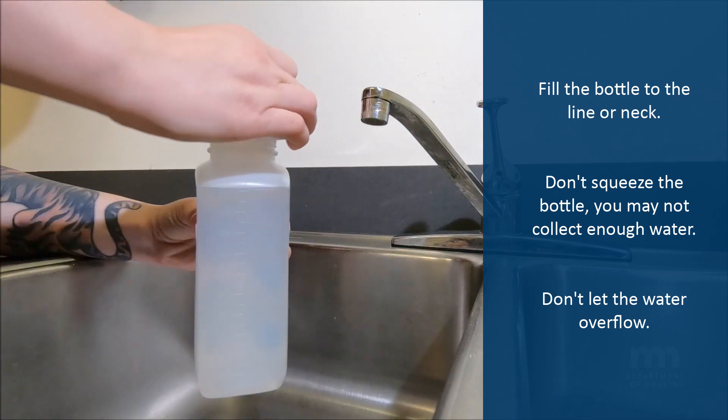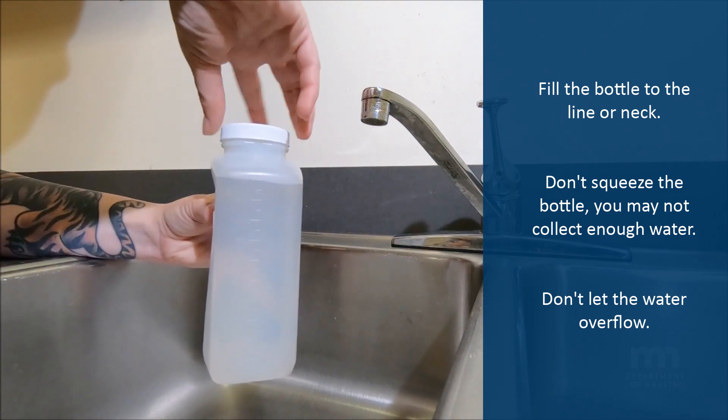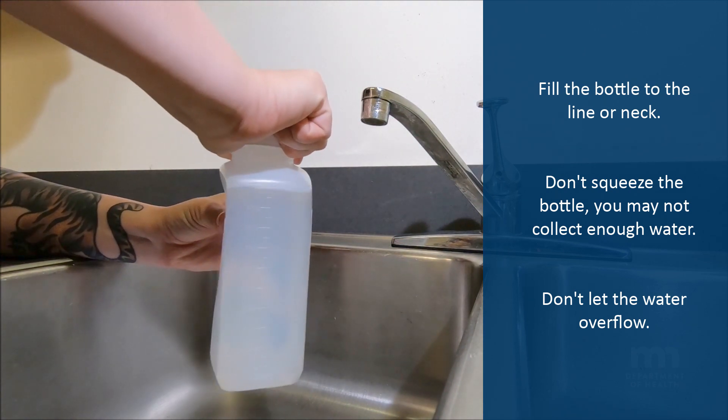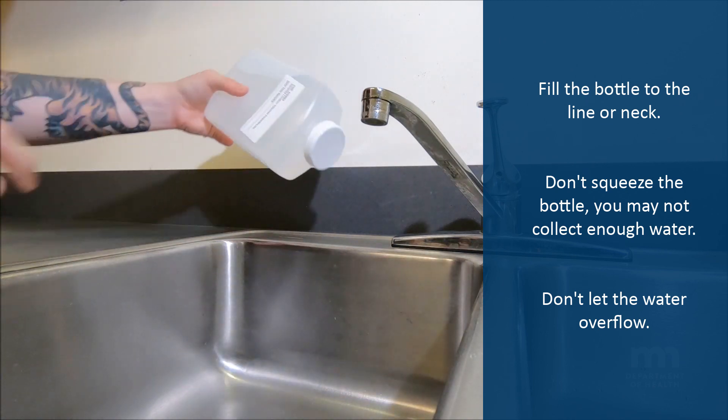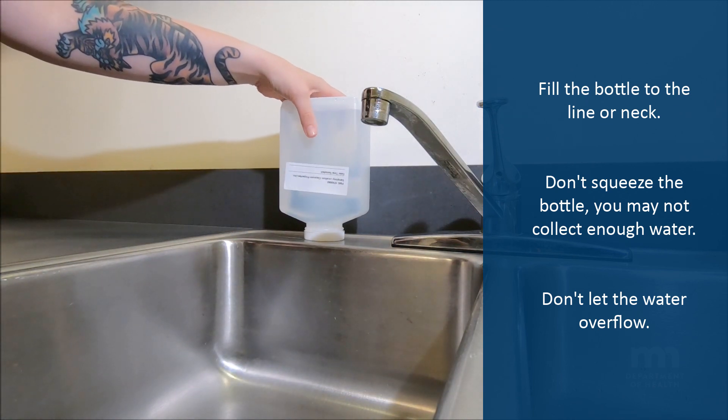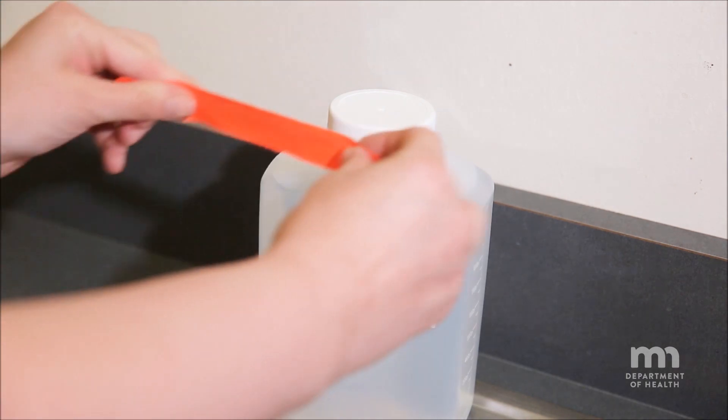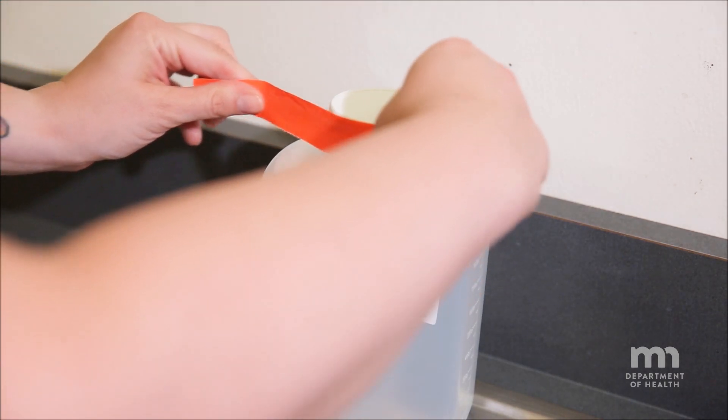Screw the cap back on the bottle. Make sure the cap is on securely. Turn the bottle upside down to make sure the water does not leak. You may tape the cap to seal the bottle.